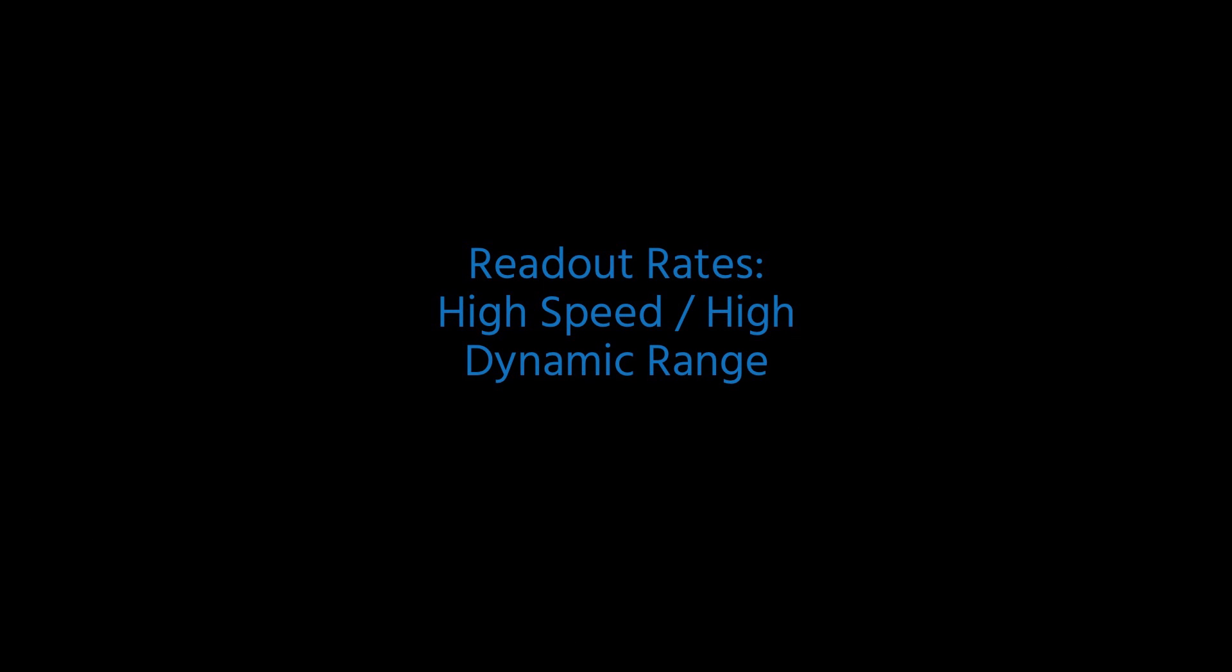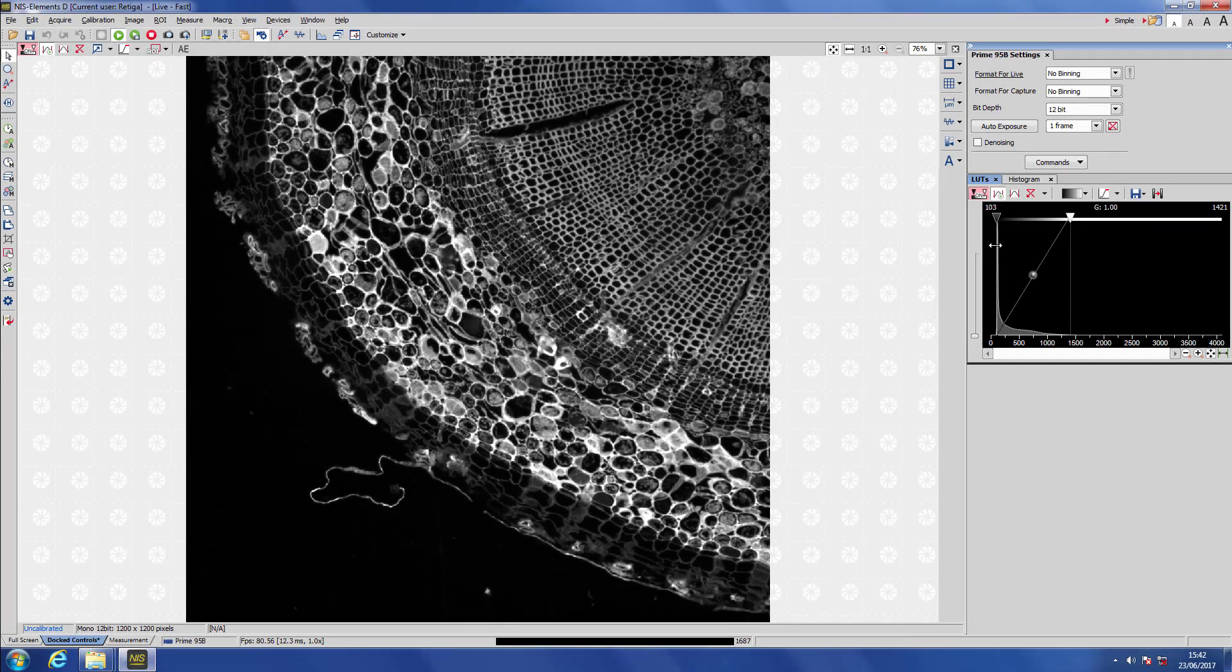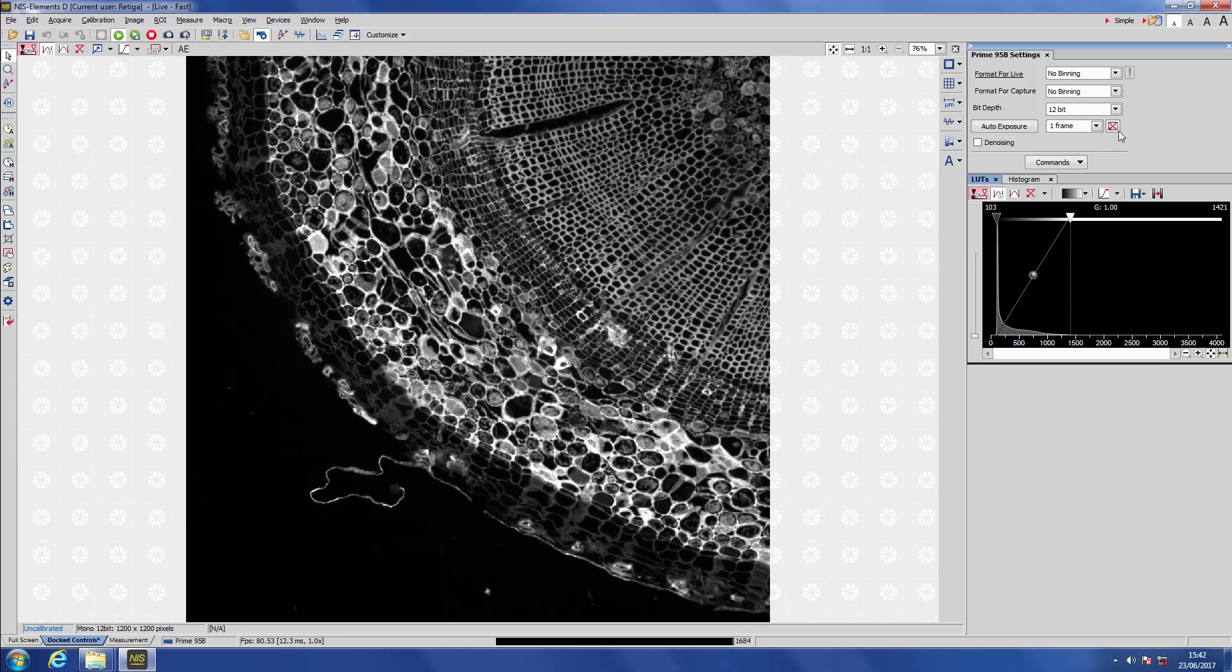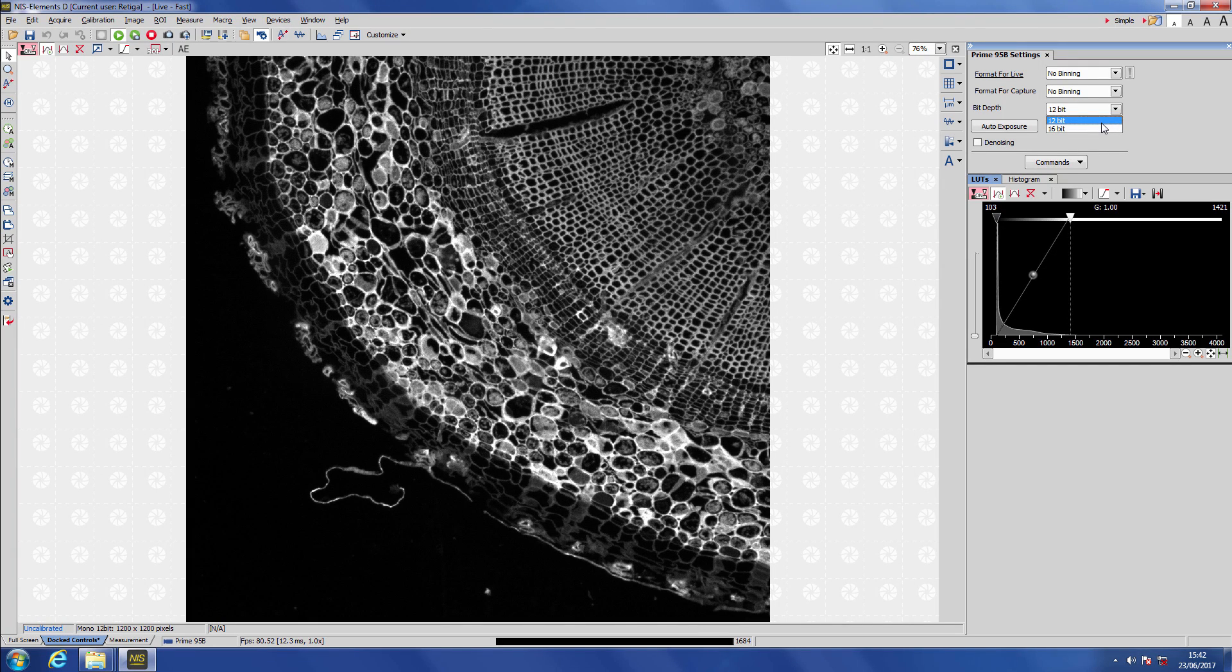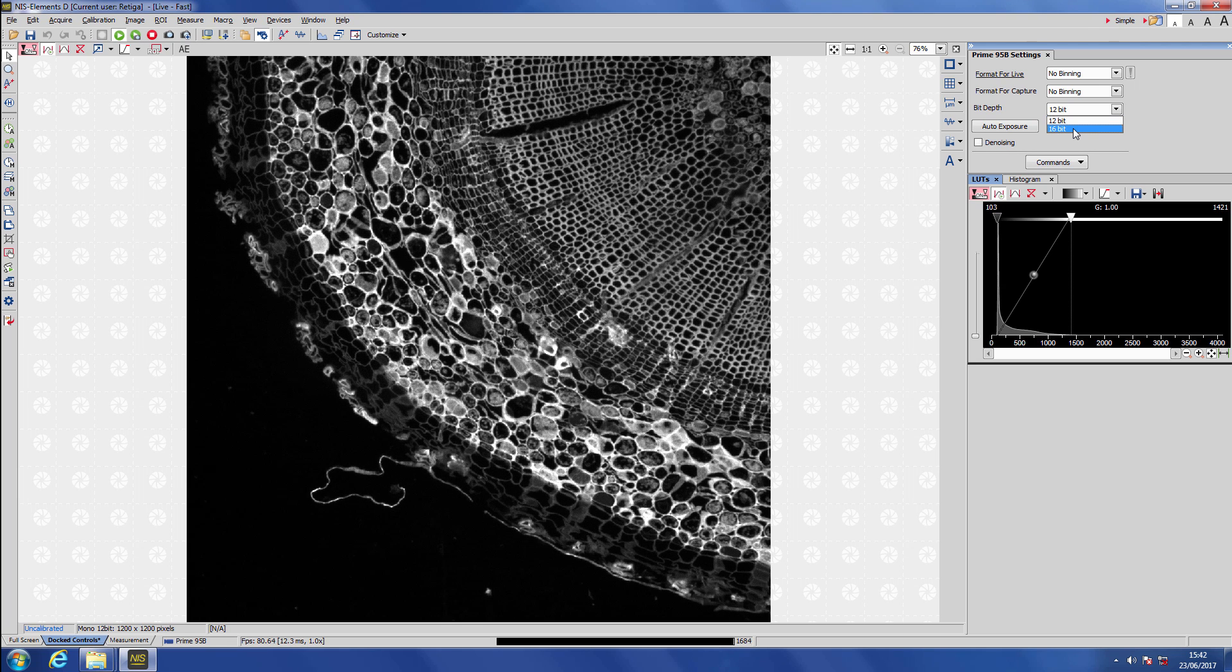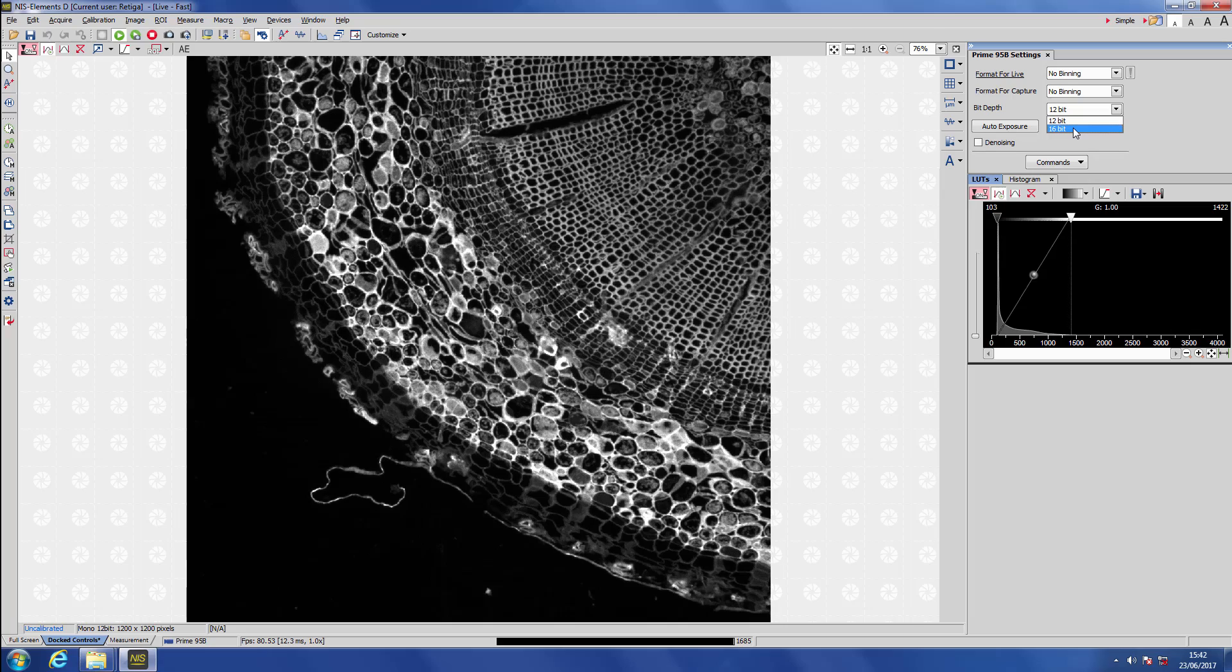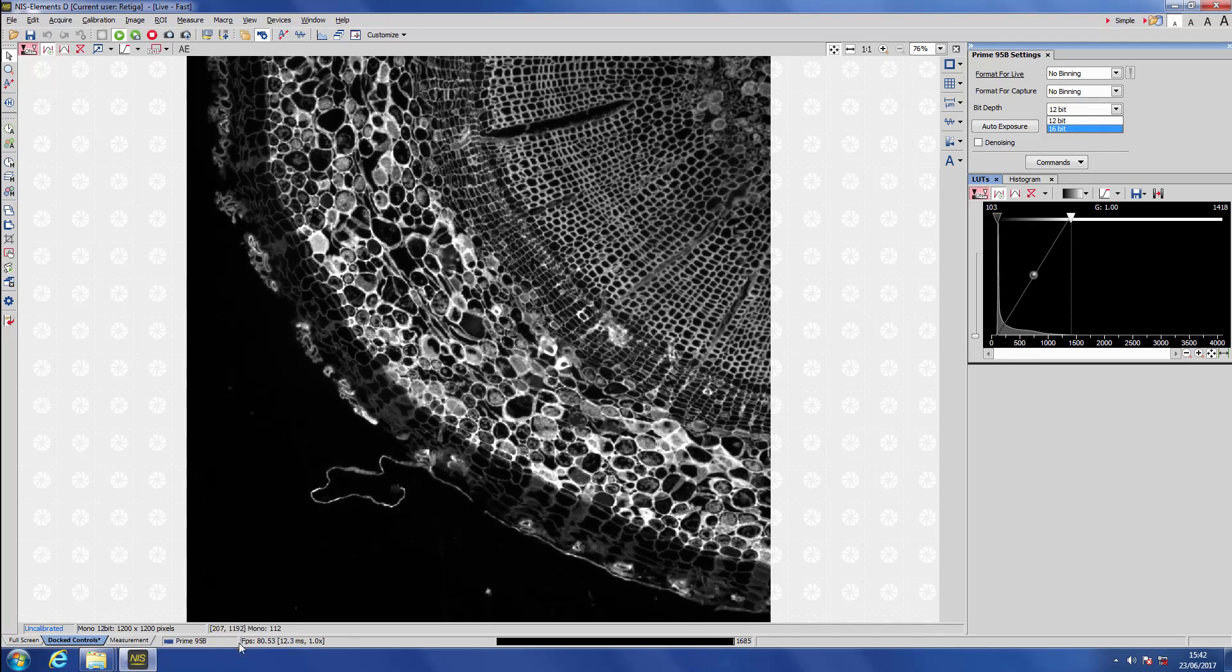The Prime 95B has two readout rates possible. One is suitable for high speeds and the other is suitable for high dynamic range. We can change this by changing the bit depth in the Prime 95B settings in the top right. 12-bit, the mode we're in at the moment, is for high speeds. So here we run at 82 frames per second full frame, with a maximum value in each pixel of 4096.